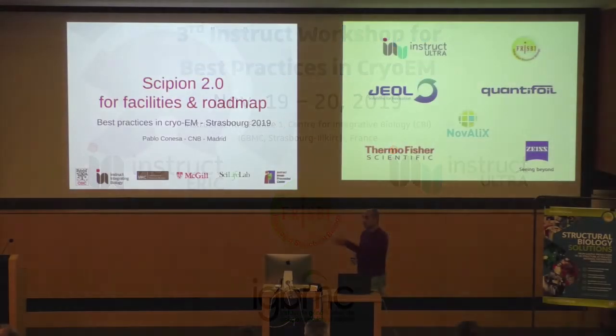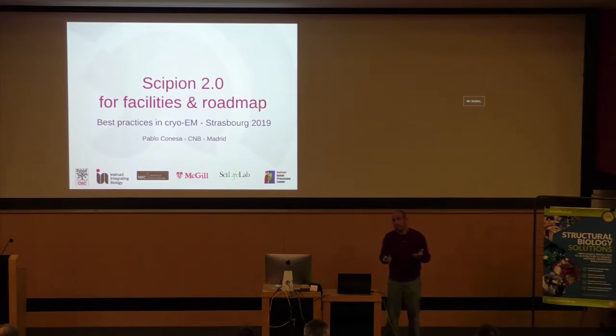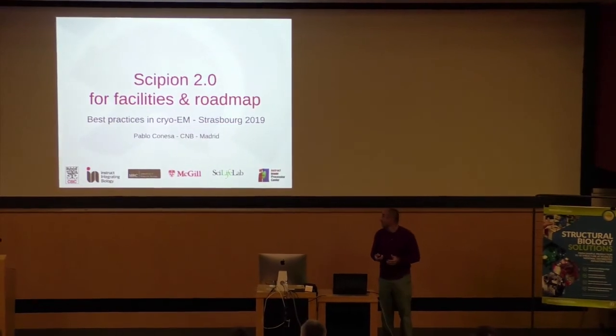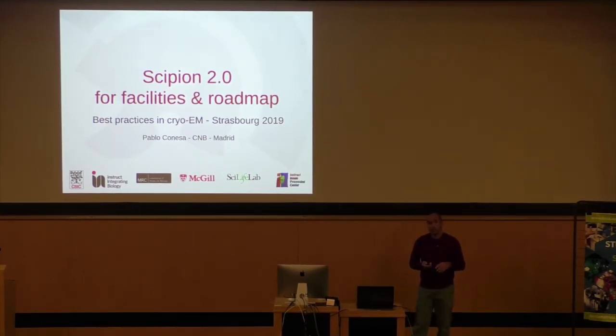Well, I don't know his name, but I'm going to talk about Scipion 2.0. What are the latest developments? I will be focused on what I think would interest facilities. There are many more things, but I will focus mainly on what can be done with Scipion in a facility. I will also have a few slides about what I am planning to do, again focusing on what I think is interesting for facilities.